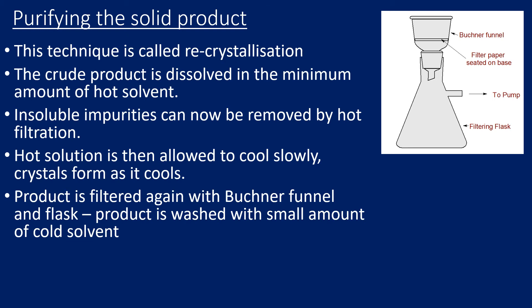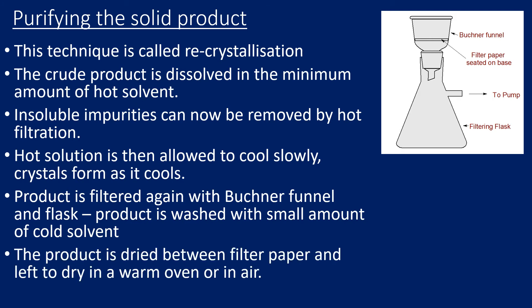At this point, we wash the product with a small amount of cold solvent. Finally, we take our pure product and dry it between filter papers, then possibly leave it in a warm oven to dry further.